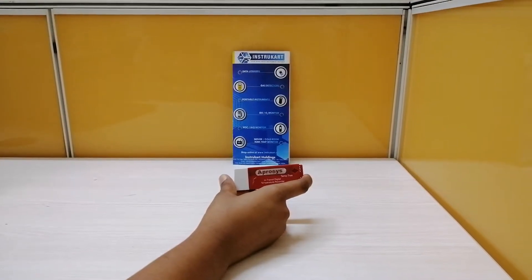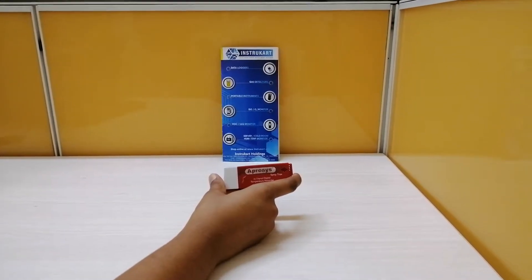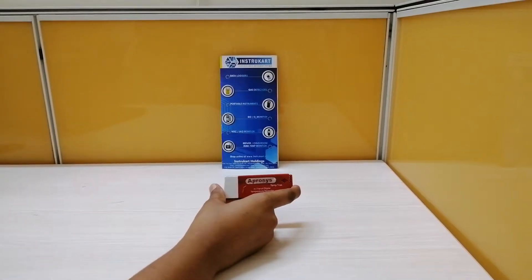This USB data logger has an accuracy of plus or minus 0.5 degrees Celsius with a resolution of 0.01 degrees Celsius.